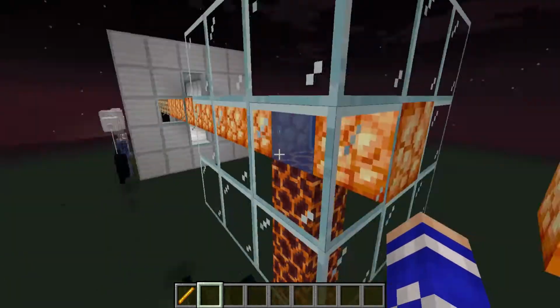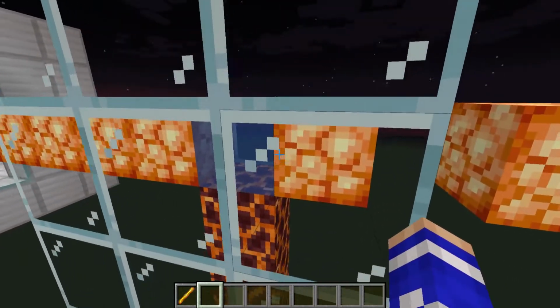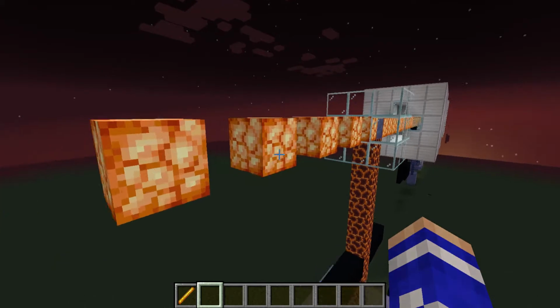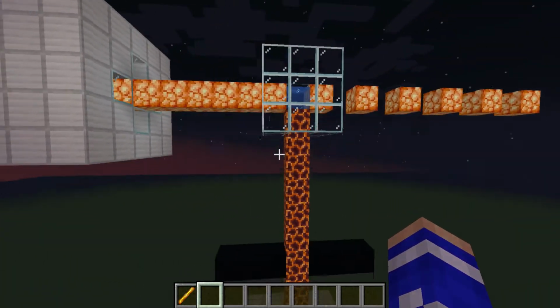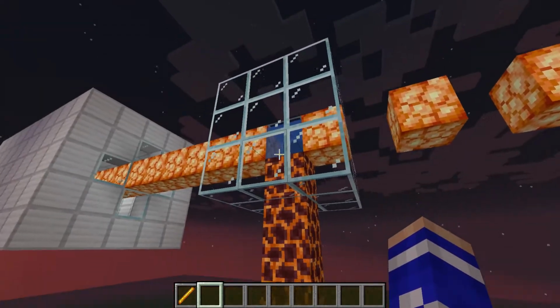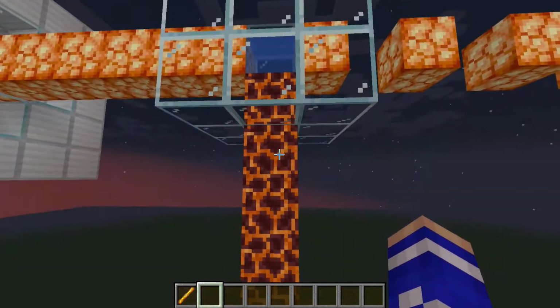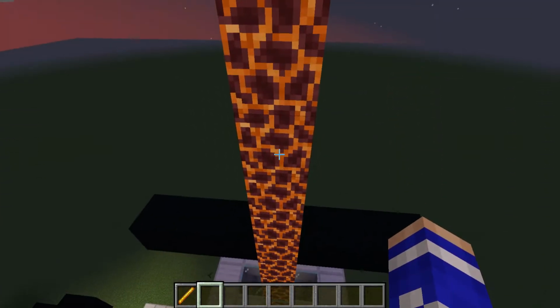And what this allows for, we have our full glass cuvette, is that some of this light is going to hit the sample and it's going to get transmitted through the sample. However, we're not analyzing that. What instead we're analyzing is the light that comes off at about a 90-degree angle to the sample. So some light will get transmitted. More light as well is going to get emitted at a 90-degree angle to the sample.